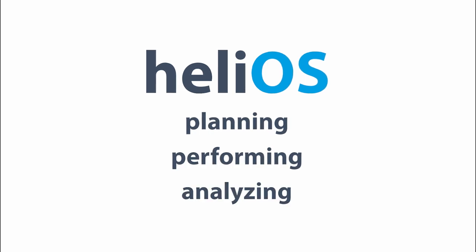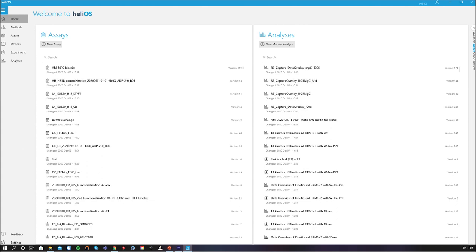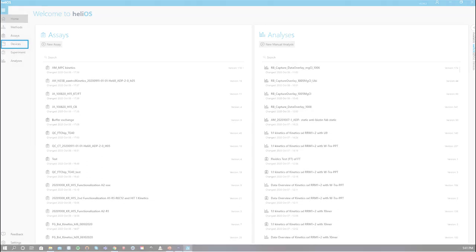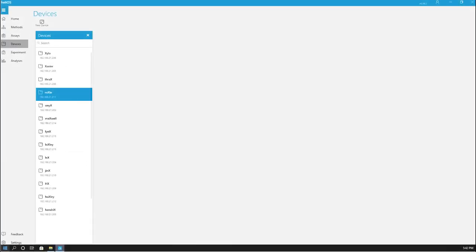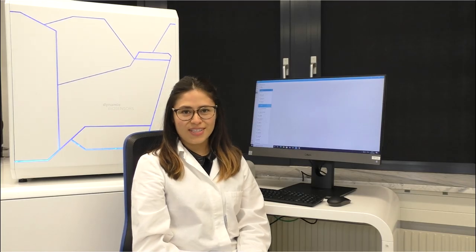Helix instruments are controlled by the Helios software, which is responsible for planning, performing, and analyzing your experiments. Let's first connect our PC to the Helix instrument we are going to use. In the device list, we see all Helix instruments in this network. Because every Helix module has its own embedded PC and dedicated IP address, the instruments form a network of biosensor modules. We can take control of any instrument in the network simply by double-clicking on it. Okay, so now we are going to connect to the Helix named Roxy.